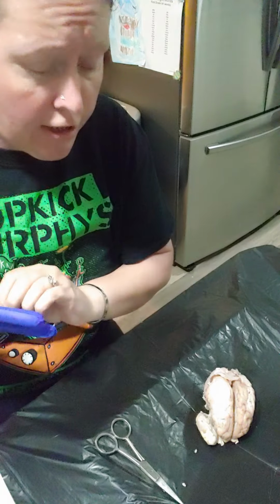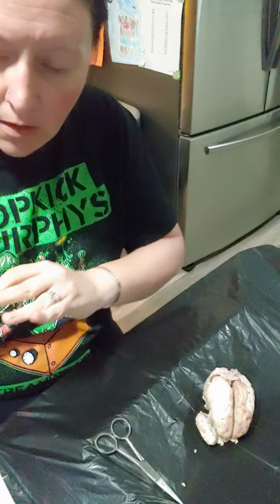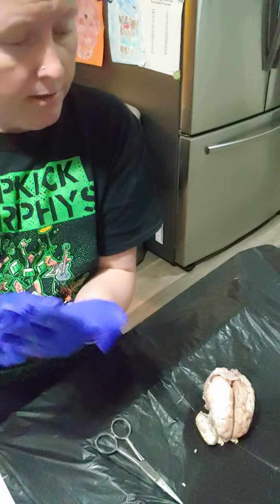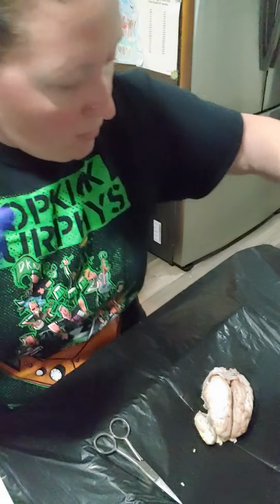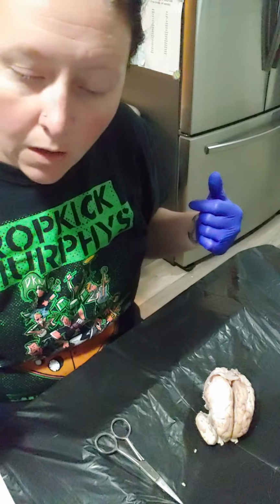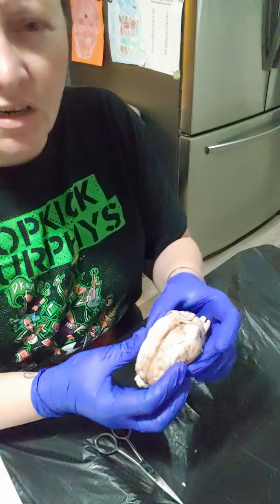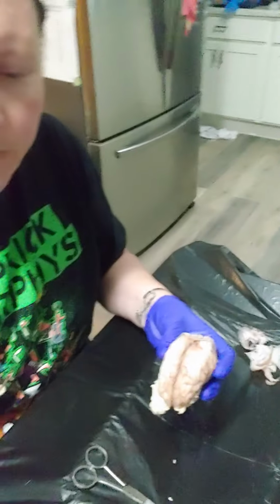I wanna start this by saying my brain was not very pretty. The video that we watched had a very pretty brain. I think my sheep died from a deformed brain. But I attempted to get most of the dura mater casing off of it. That was some tough stuff. But going over the brain as a whole, I don't know if you're going to be able to see this with the glare. I'll try.